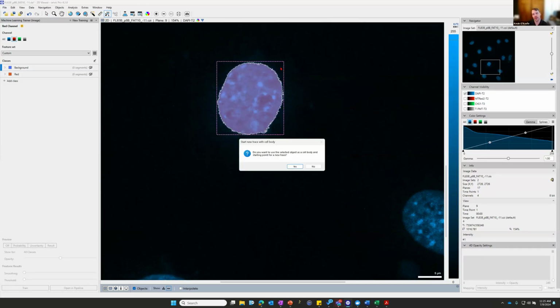Okay. There's this trace tool. This is for the case of if you're doing neuron tracing. In that example data set that I showed you, you have the neuron cell body, the dendrites, axons, neurites extending out from it, and then you saw it was colored based on branch order. If the branch order is messed up, maybe these two dendrites crisscross and the tracing messes that up, you can go and edit this, and it just literally looks like little nodes on the branches. So you can just say this node should be here, this node should be here. You can just drag and drop and click to correct it.